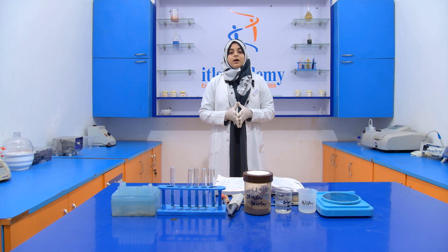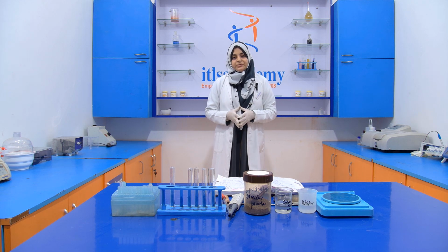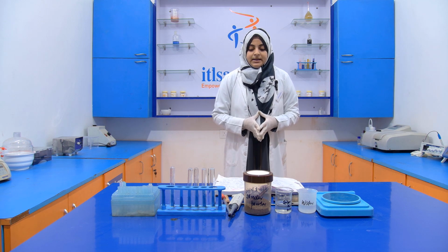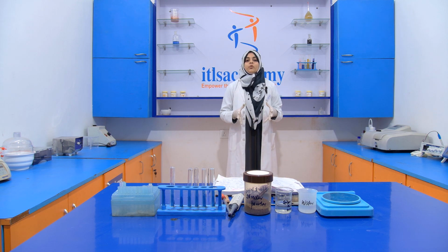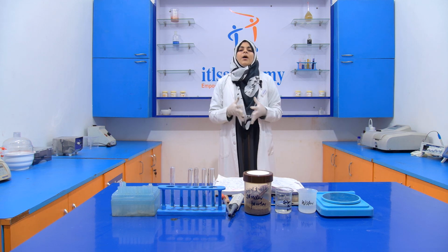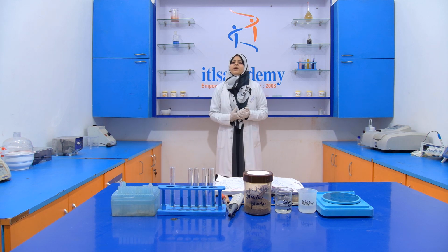Today we are going to perform another experiment in the series of food adulteration, and today the experiment that we are going to perform is the detection of common salt in coriander powder. Now before starting this experiment, we have to know why this adulteration is performed in our food industry.